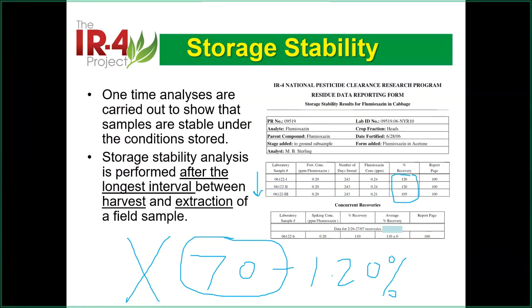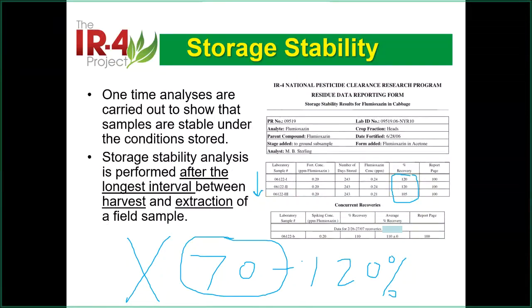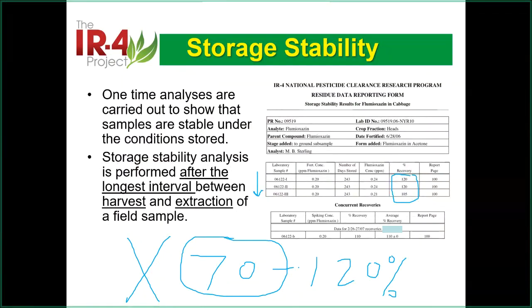Some people can say, oh, this is my storage, my sample is in the same condition, can we do the back calculation? In science, you can, but in reality people don't trust how you do the work. Most likely people will reject your work. So this is important: make sure you analyze the sample as soon as possible. Don't wait 5 years to analyze, because your SS recovery will be low.